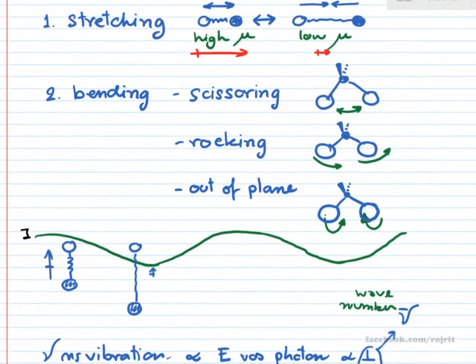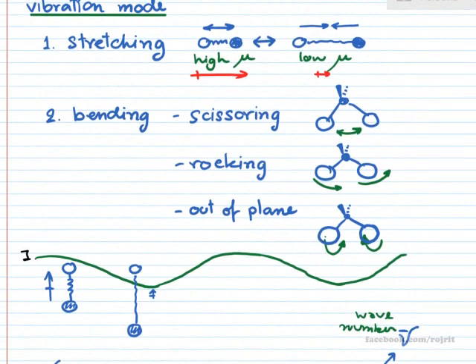So obviously, if your chemical bonding here has no dipole moment, then there is no interaction between the dipole moment and the electric field of your IR photon. Okay, so IR is active with only polar bonds, polar covalent bonds, sorry.